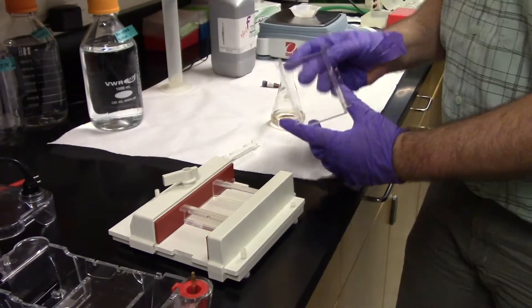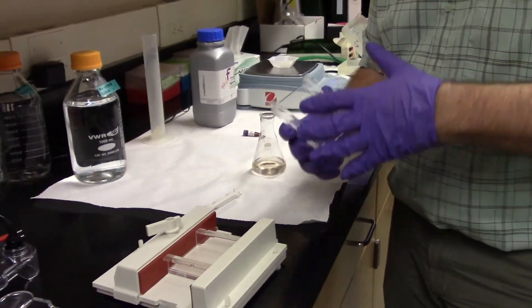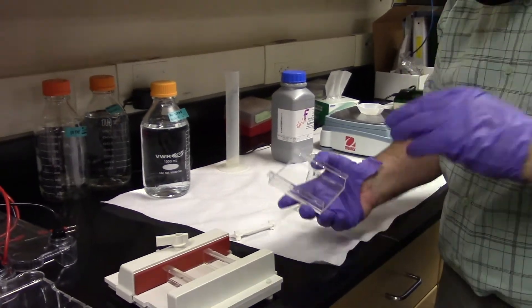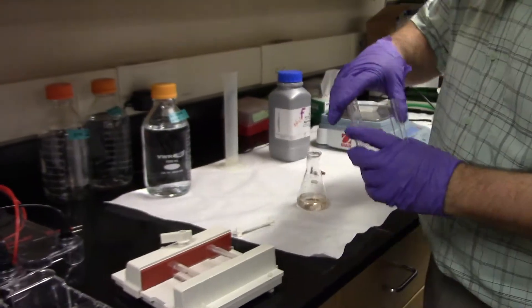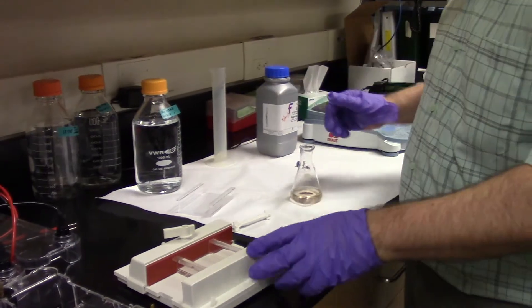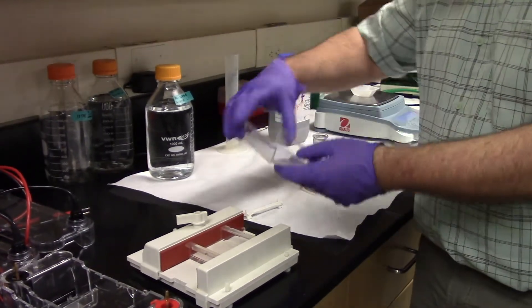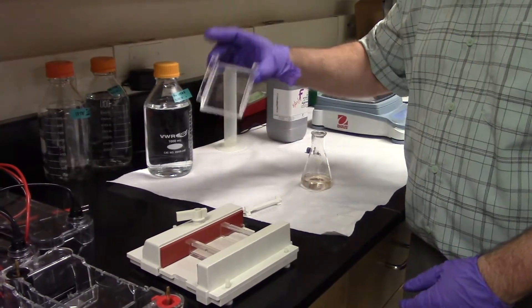If I wanted to make a bigger gel, because I wanted to separate out the sizes of DNA more, a thousand at the top, 500 the middle, 200 at the bottom, I wanted to spread out large pieces of DNA from each other. I could have used maybe 80 mils of this liquid and cast it in a larger gel boat.